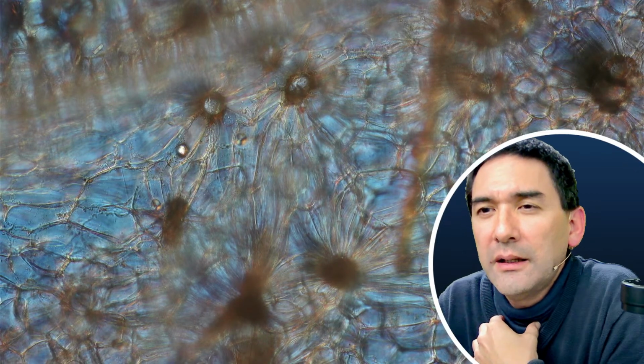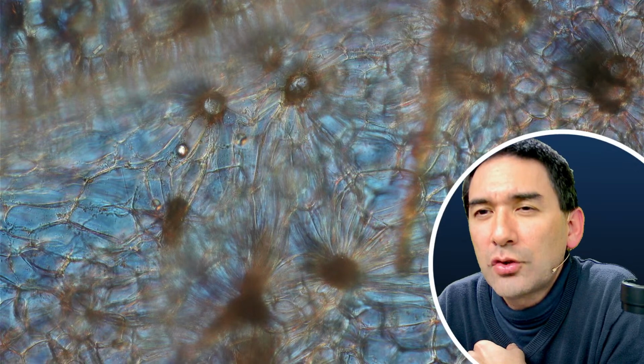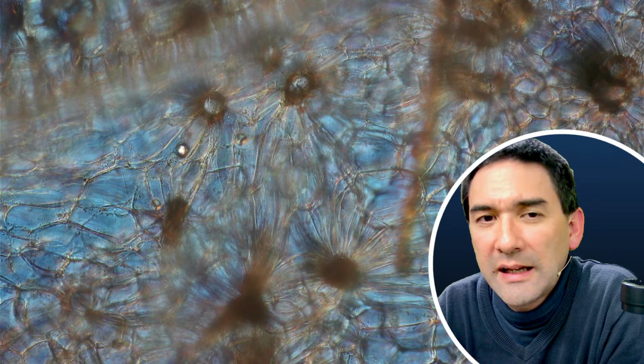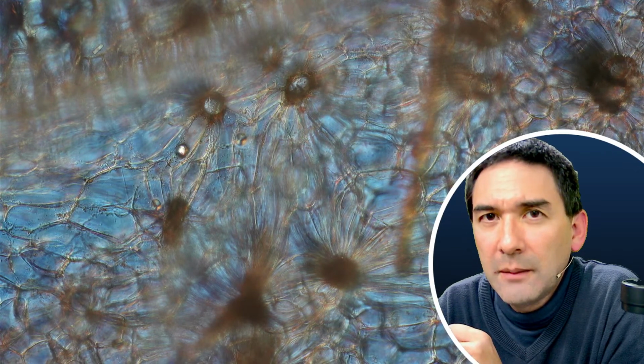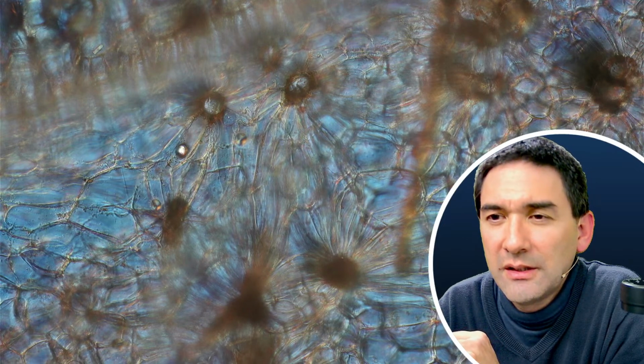Dilute iodine. Yes, maybe you turned the micro too far. Maybe try very small steps without pressing your finger. Yep. How do the starch grains look in polarized light? The thing is I do have polarized light right now. However, I'm not using cross-polarized filters. Okay, so this is a little bit the thing.